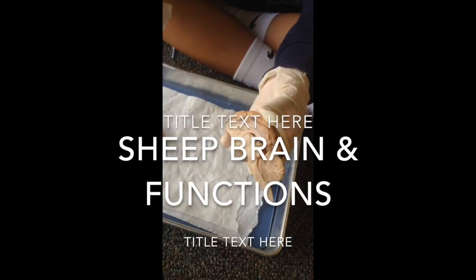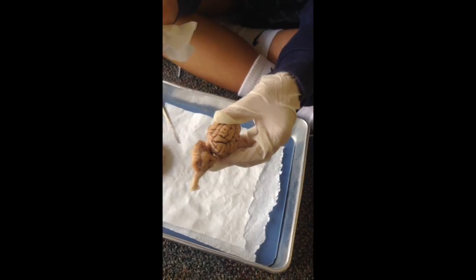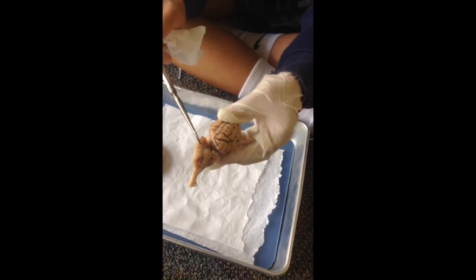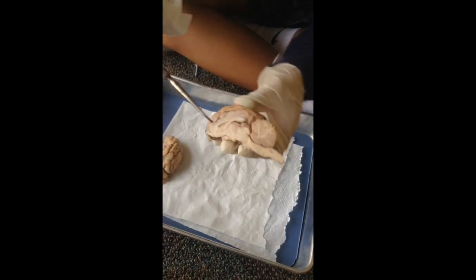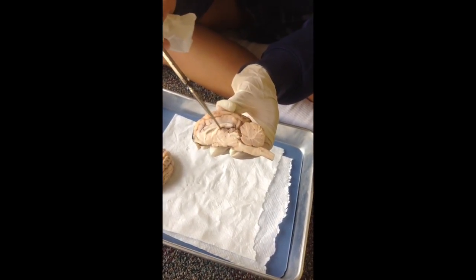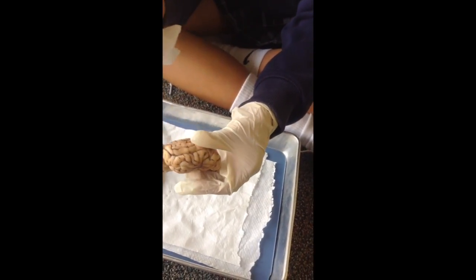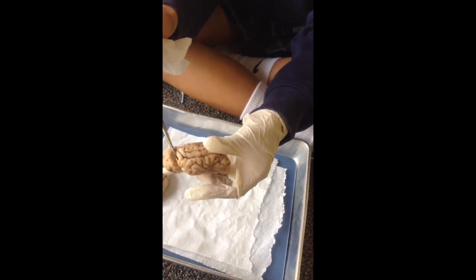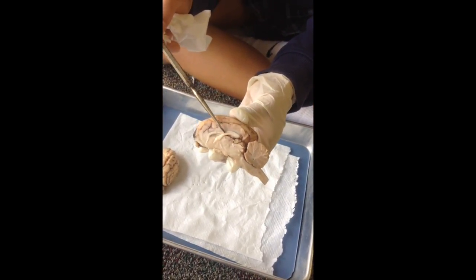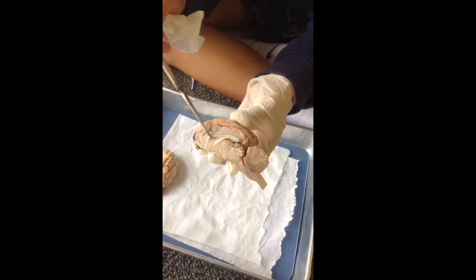Functions of the sheep brain. The cerebellum. It's the little brain attached to the rear of the brain stem and helps coordinate voluntary movement and balance. The cerebral aqueduct. It's a canal connecting the third and fourth ventricles. And the cerebrum is an area of the brain responsible for all voluntary actions of the body. And the corpus callosum, it's the large band of neural fibers connecting the two brain hemispheres and carrying messages in between them.